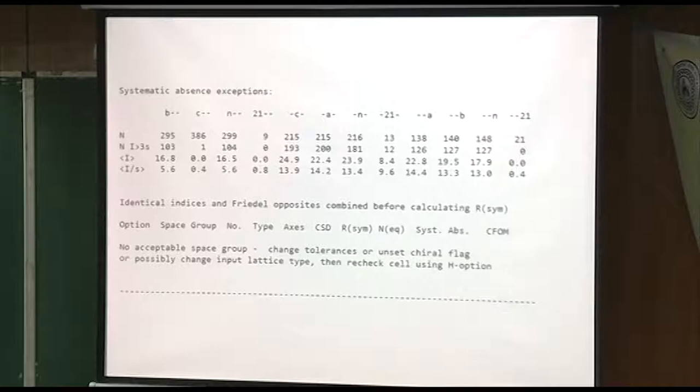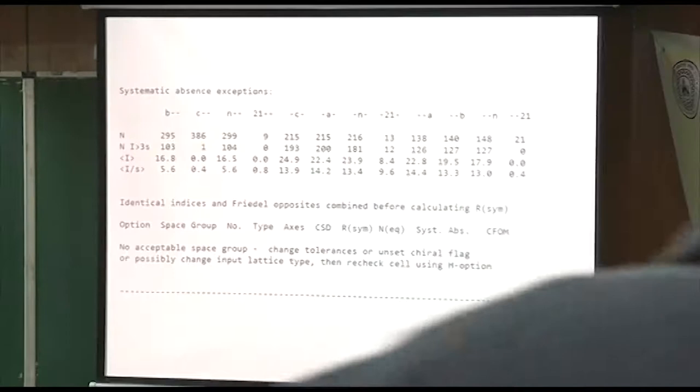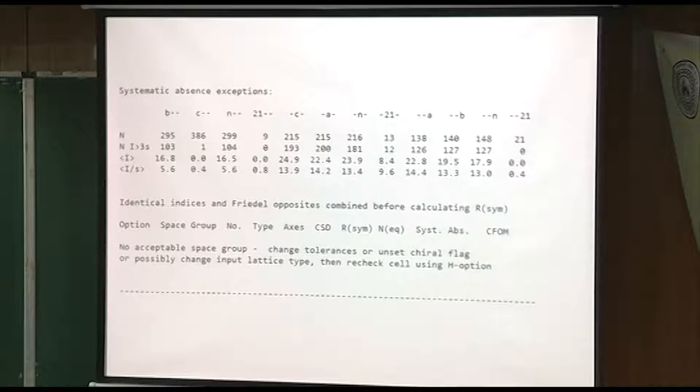Looking at this though, I want you to notice these extinctions right here, it's a C-glide, but it's in the A position in the space group. And here's a screw axis that's also in the A position. If it's monoclinic P21 over C, those should both be in the B position because it's the B axis that's unique in monoclinic.